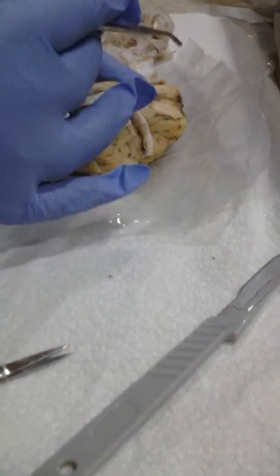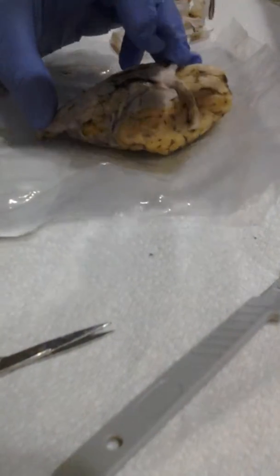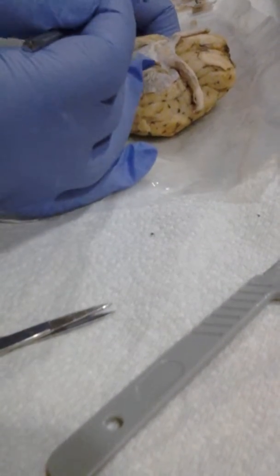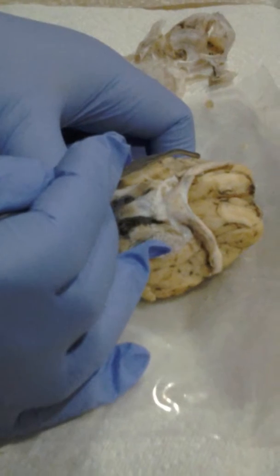Okay, here we have the frontal lobe up here. Then just below it is the olfactory bulb, the synapse point of cranial nerve 1.